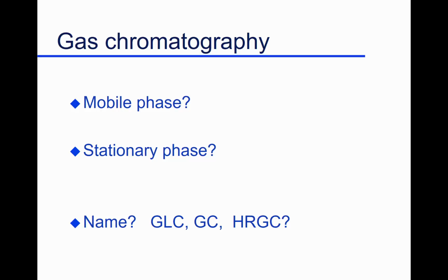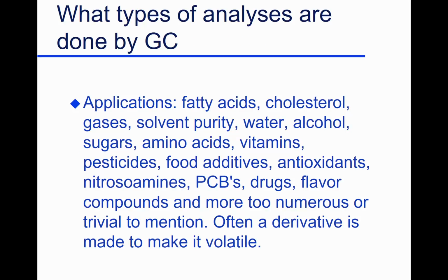And so again, from a name standpoint, you might find gas liquid chromatography. I like GC, gas chromatography. Some people may talk about high resolution gas chromatography. That's all pretty much high resolution at this point. There was a day when it wasn't high resolution.